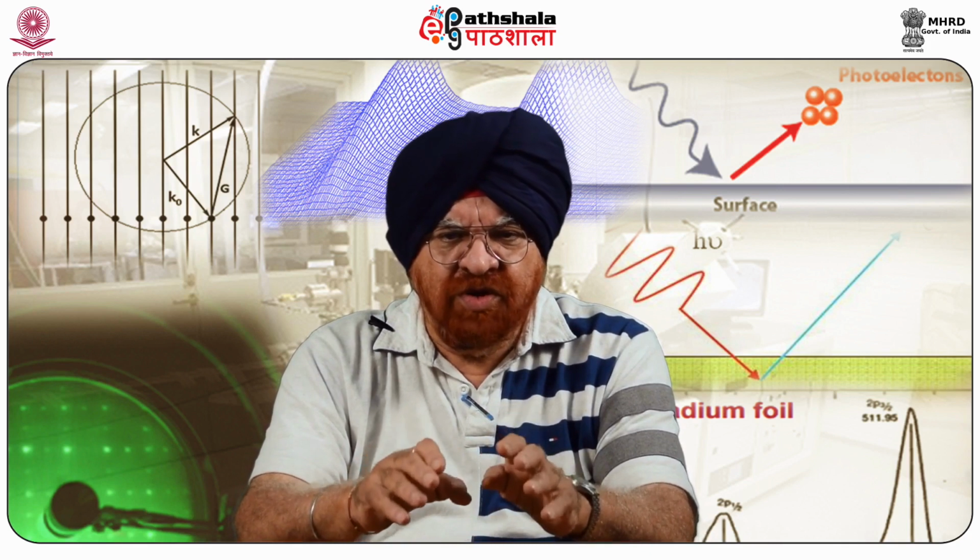So, having given details of the introduction, then the instrumentation, and finally the analysis, we now summarize what you have learned from this module. The dielectric model holds also when the material on which the molecule adsorbs is not a metal. When measuring the intensity of the electron energy loss peaks and comparing to other experimental results or to theoretical models, it can also be told whether a molecule is adsorbed normal to the surface or tilted by a certain angle.